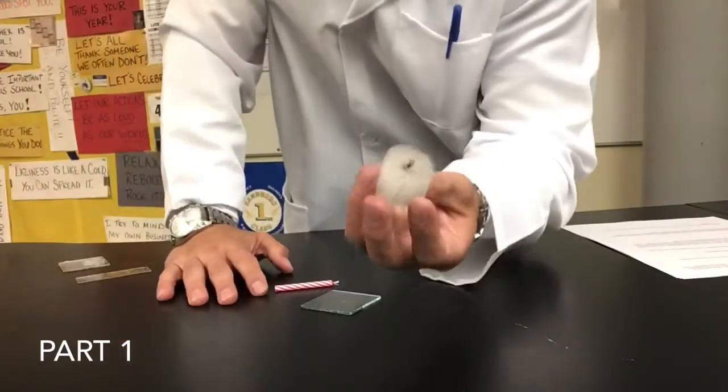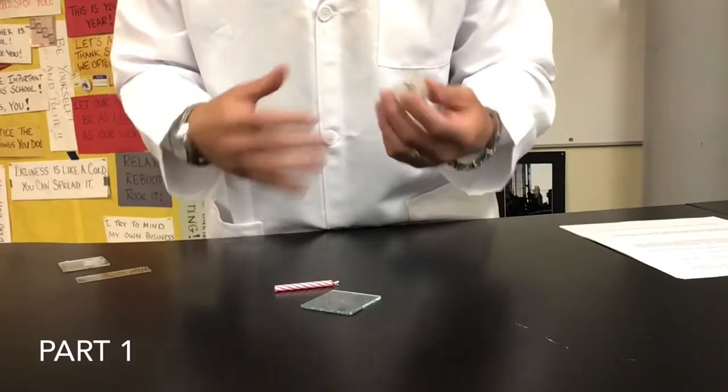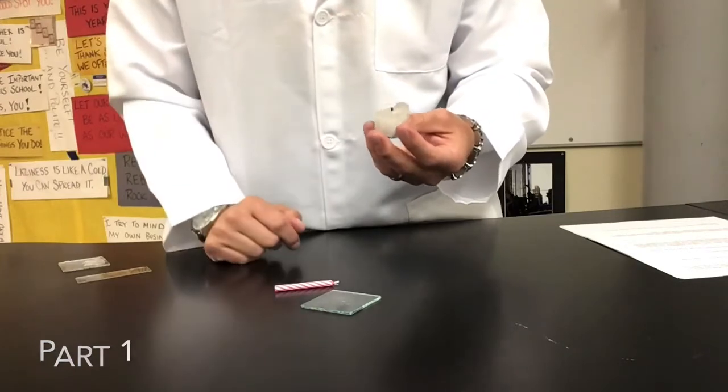Now remember, since this is a video, feel free to pause it at any time to make sure you can write down all of your observations in your lab write-up. There's no need to feel rushed, but keep that in mind. You can always hit that pause button and then play when you're ready to move on.